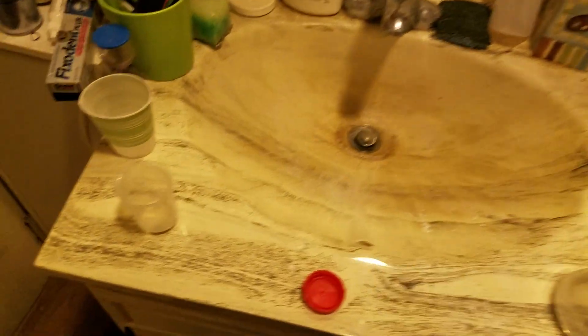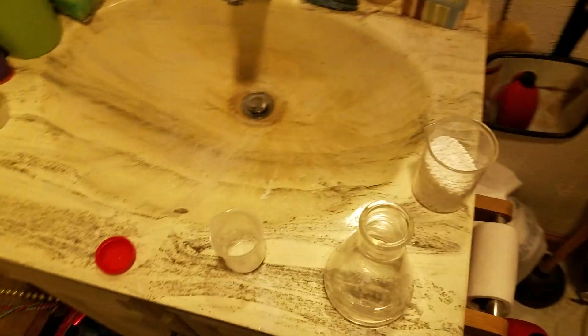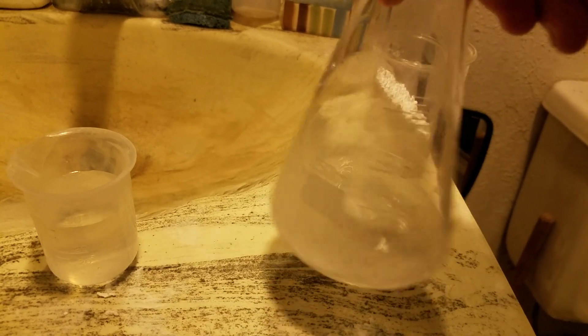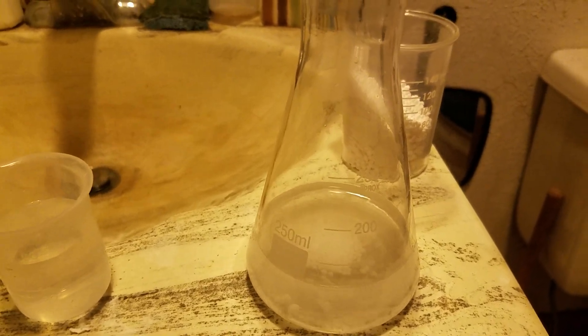Now what we're going to do with the tiny beaker is we're just going to put some distilled water in there as well, and dissolve a little bit of baking soda into it. That's mostly dissolved. That's way too much baking soda though.